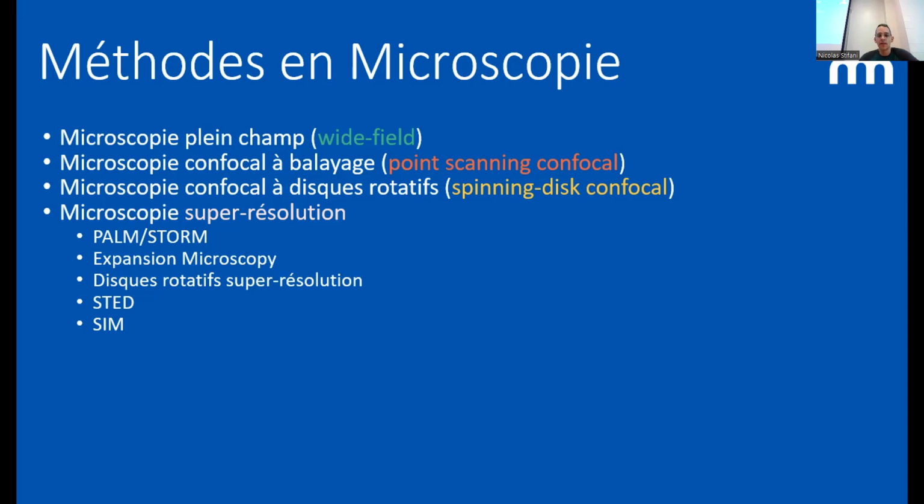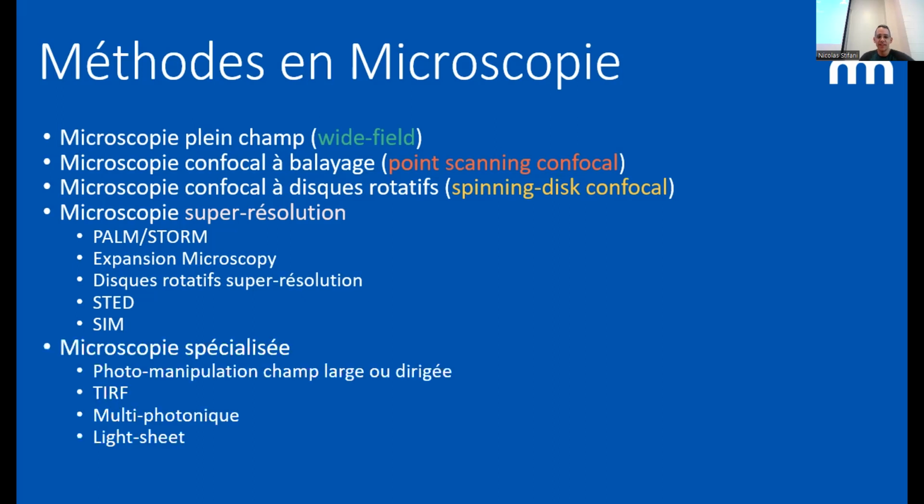There is also a variation of spinning disk confocal that can be a bit super resolution. The first one was STED. The real optical method for super resolution was STED, and there is SIM. I can explain what the acronyms are, but I think for you it doesn't really matter. You're going to call them STED and SIM and PALM and STORM, and that's totally okay.